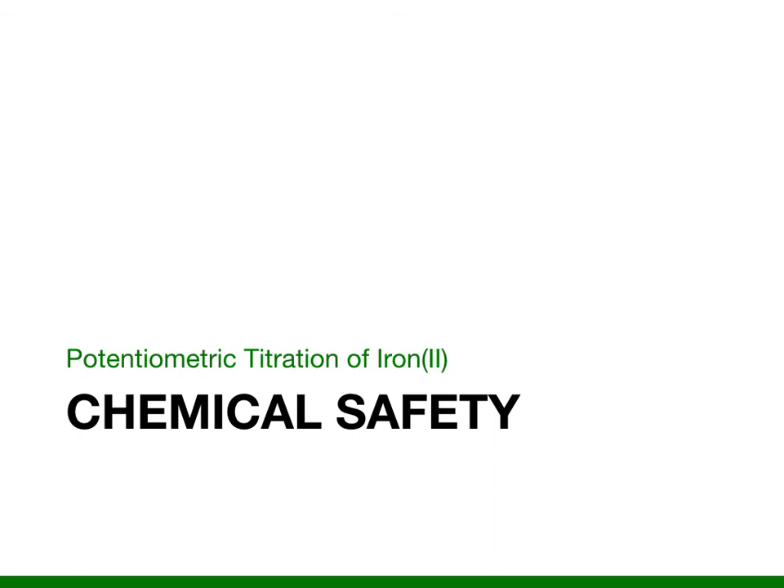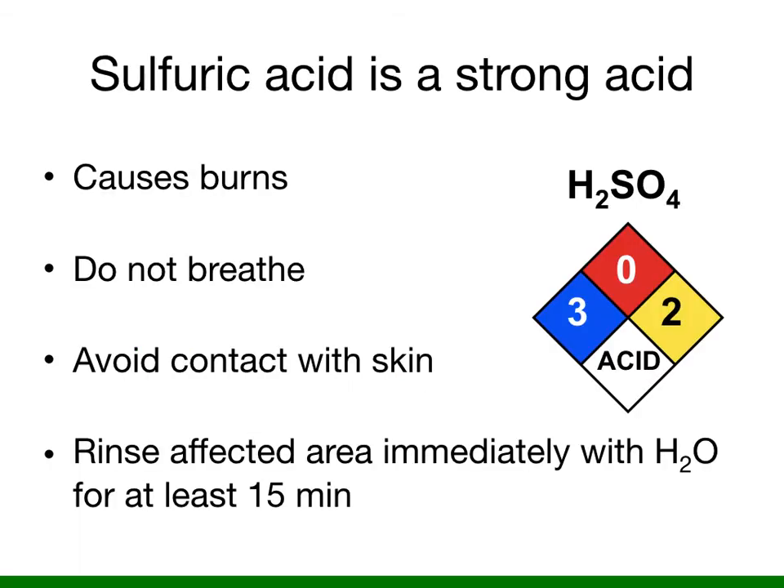Some of the chemicals in this potentiometric titration of iron II are very dangerous, so let's talk about safety. Sulfuric acid is a very strong acid that can cause burns, and you don't want to breathe it or let it contact your skin. You're going to be using a concentrated sulfuric acid solution as well as a more dilute two-molar sample, so exercise caution with both. If any sulfuric acid contacts your skin, rinse the affected area immediately with water for at least 15 minutes.